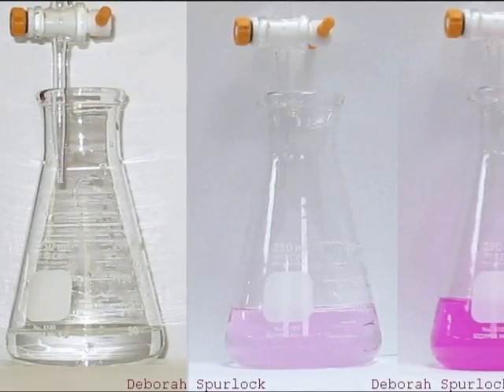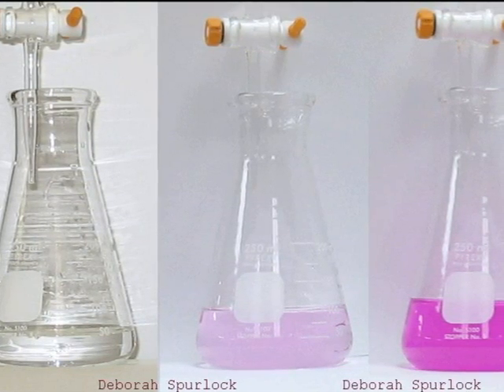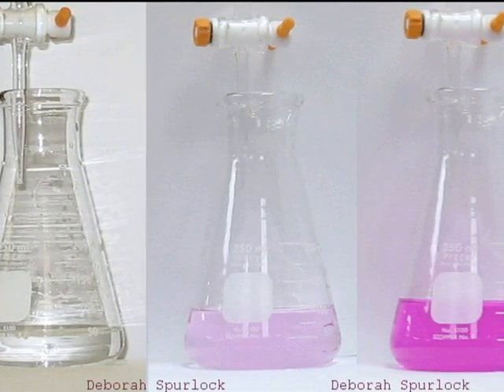In order to find the end point, an indicator is used. The indicator exhibits a color change as the pH is varied. In this case, phenolphthalein is used as the indicator.